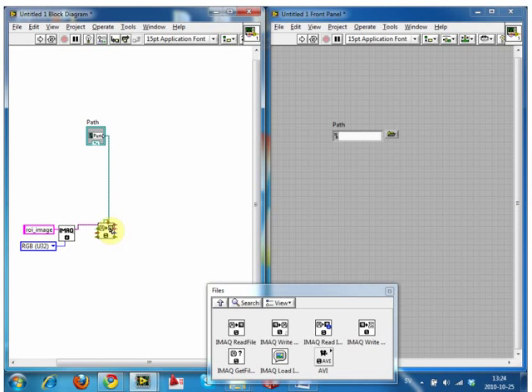Okay. Now these, like I showed in the first thing, will run in order. If we ran this right now, because we can, it says you can run it, totally fine. This will run first. But what is the output? Nothing. You don't have to wire an output for it to have no errors. That's why you run it, to see if there are errors.